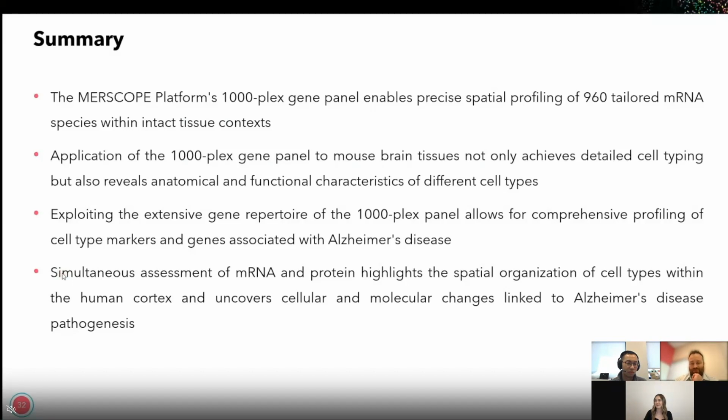Great, thank you. Next question here. This is a two-part question. It asks, does cell segmentation account for diverse cell shapes, for example, axons of neurons that may be distal from the cell soma? And how does segmentation ensure the transcripts far from the cell soma get segmented with their original cell and not necessarily the nearest cell soma?